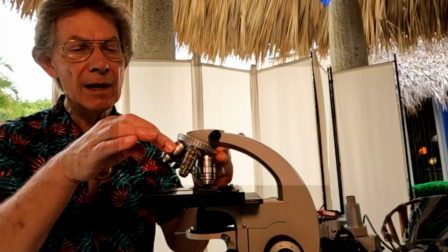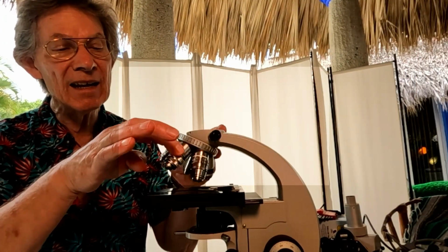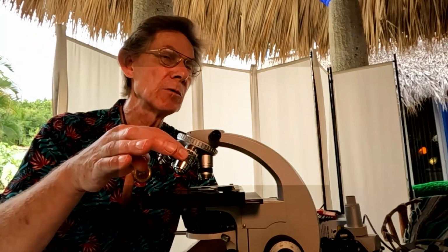So the lenses are extremely important. They start at a very low power, and then we move to a higher power, and a higher power again, and again, all the way up to the highest power, which is the 100 times lens, or objective, which is what the scientific word for these is. They're called objectives.